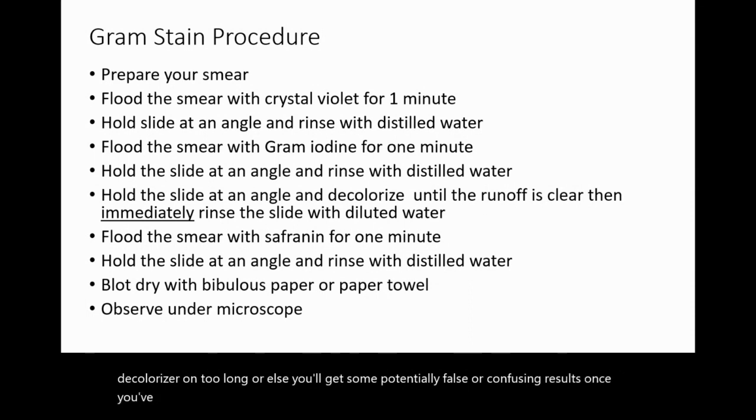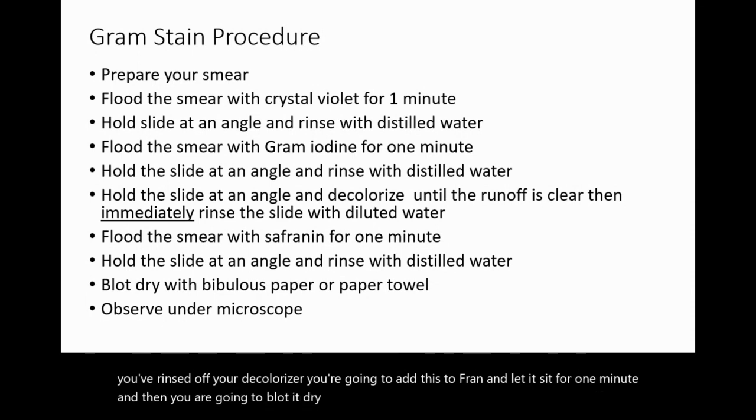Once you've rinsed off your decolorizer, you're going to add the safranin in, let it sit for 1 minute, and then you are going to blot it dry with bibulous paper, and then you're ready to observe it under a microscope.